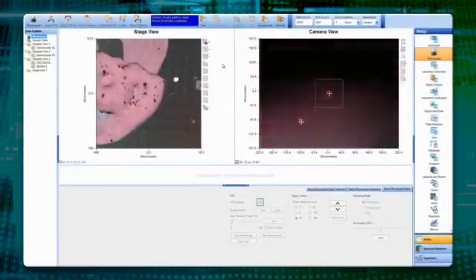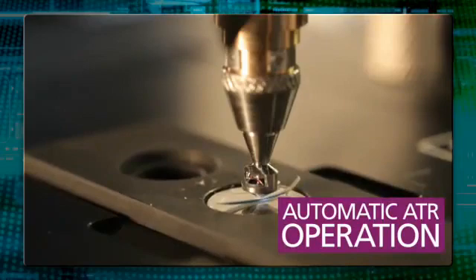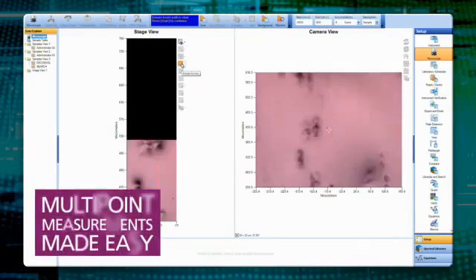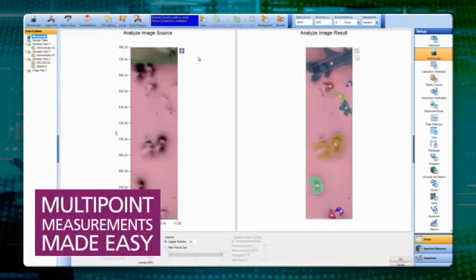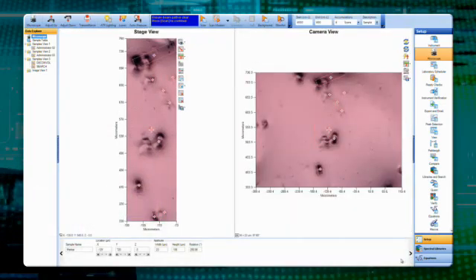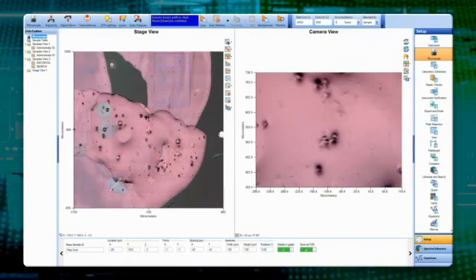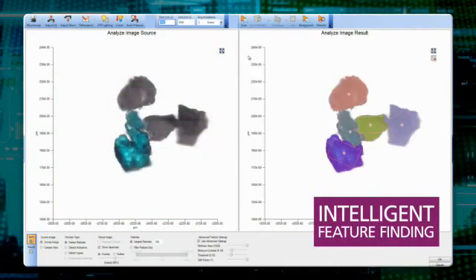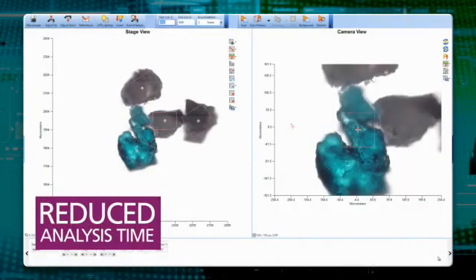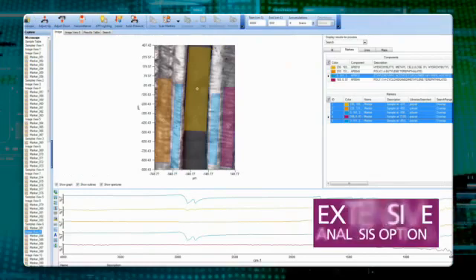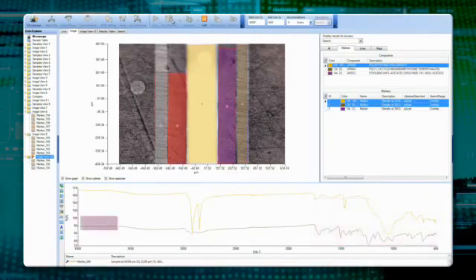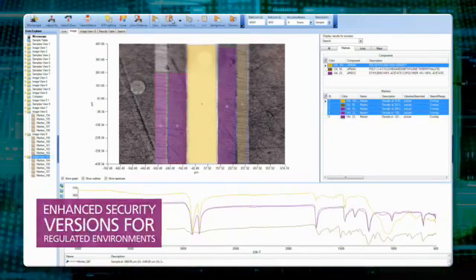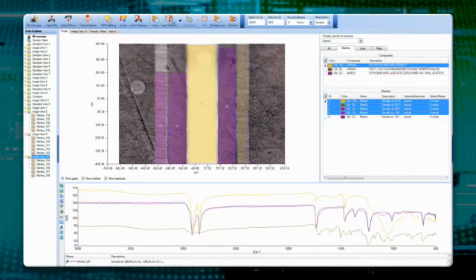Samples for IR microanalysis come in a variety of shapes and sizes, and spectral analysis can be a challenge for non-specialized operators. The smart automation accelerates setup and analysis, enabling you to get results like an experienced IR spectroscopist. Automatic sample viewing with novel feature finding quickly pinpoints the important regions of interest. The system can automatically determine optimum setup parameters for multiple regions or particles to dramatically reduce overall analysis times. Combining data collection and sophisticated spectral analyses drives faster results and decisions. Intelligent software helps you overcome analytical challenges, providing expert results whatever your experience level.